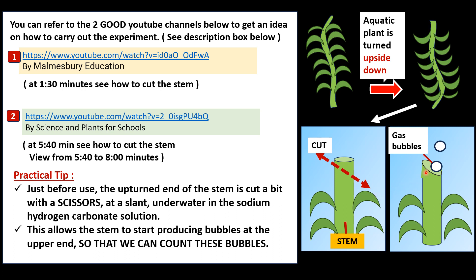This will allow the stem — cut in a slanted pattern — to start producing oxygen bubbles. The oxygen bubbles travel through the vessels inside the plant and come up at the end. You can see tiny bubbles start being formed at this end, which is the top end now but is actually the bottom part of the plant. Then we can count how many gas bubbles or oxygen bubbles are released in five minutes, two minutes, or one minute, depending on the question.